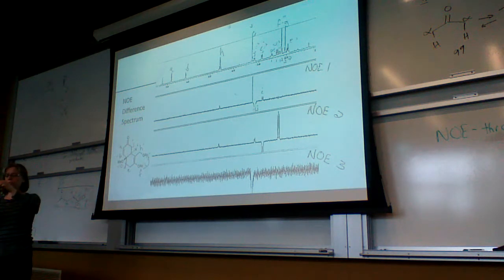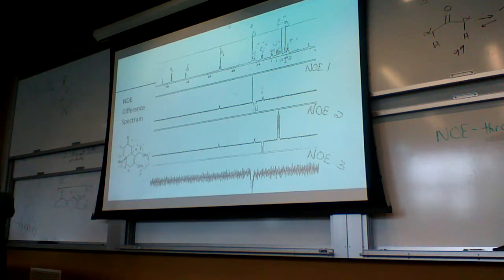The methyl group is showing up, which doesn't have any coupling to it, but when you build the molecule, you can see that this methyl group can kind of rotate and come close to it in space. And so that's a through-space interaction. It can help you assign which hydrogen is which in a proton spectrum. So I now know that this proton is the one that's interacting with this methoxy group because this hydrogen doesn't ever get close enough to interact with it.